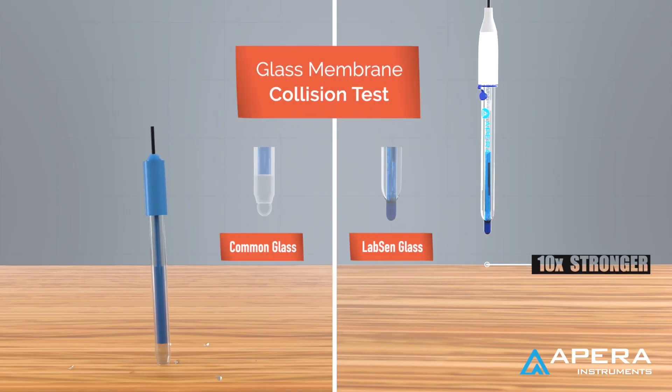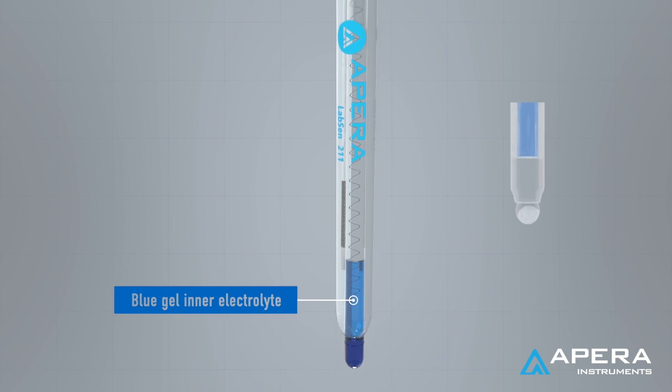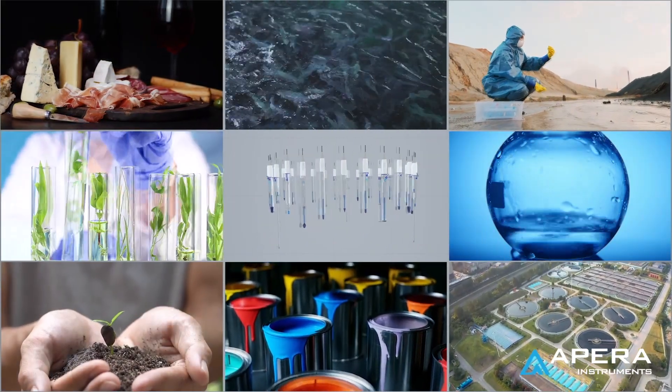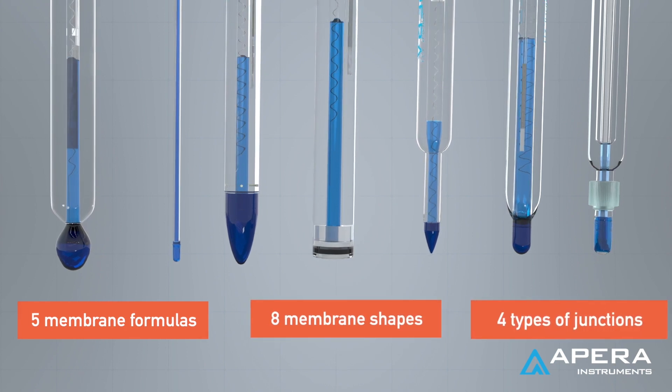The state-of-the-art LabSun PH electrodes are featured with high-sensitivity sturdy glass membranes, bubble-free gel electrolyte, multiple types of formulas, shapes, junctions, and reference systems, designed for a variety of special and challenging pH testing applications.